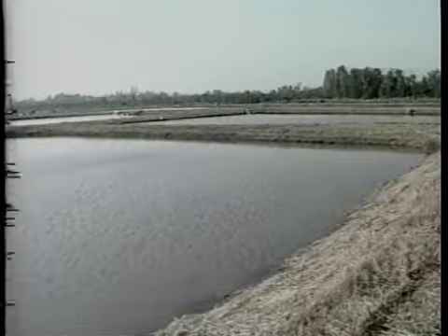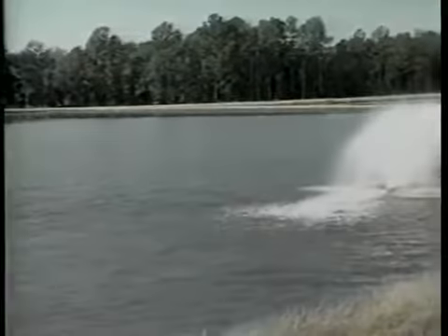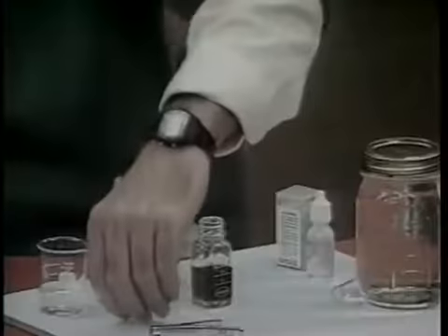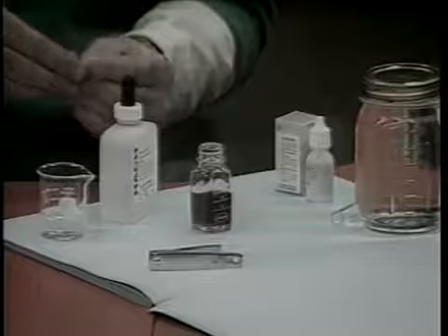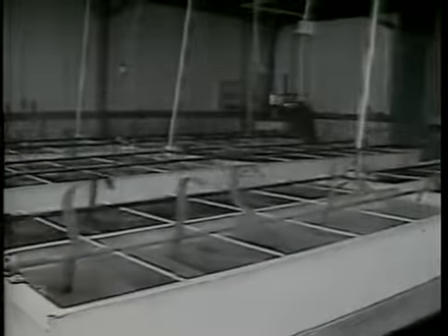The purpose of this tape is to show the types of water sources available to pond owners, how these water sources differ in quality with respect to type and location, and to describe the basic ionic constituents present in each source. A discussion on dissolved gases, plankton, aquatic plants, turbidity, and pollutants is also included. Testing procedures for several basic water quality parameters will be presented and possible corrective measures will be discussed. In addition, special considerations regarding flow-through systems will also be included.